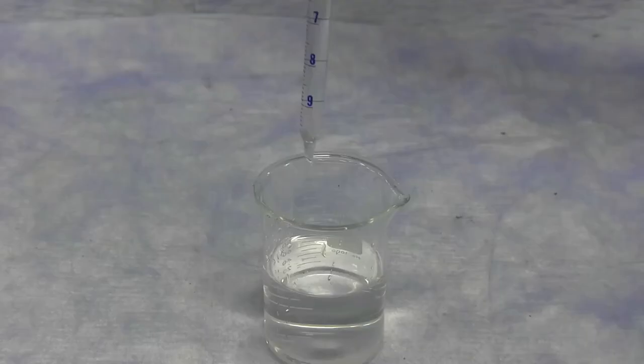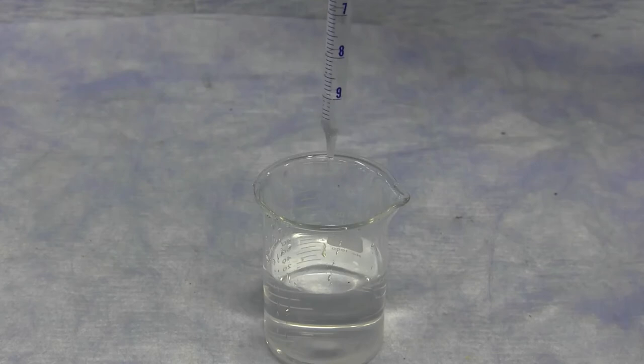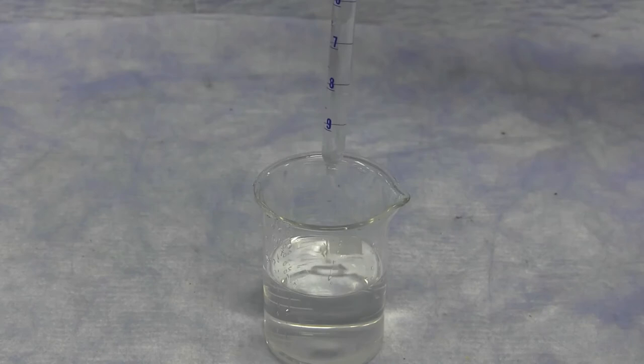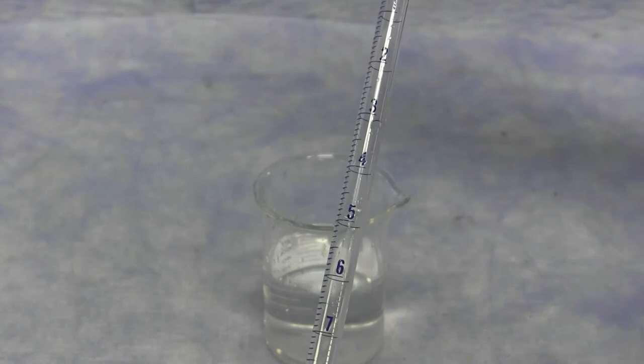As with the pipette bulb, you do not want to dispense the liquid all the way to the very tip. Typically, you would want to dispense to where there are still graduations and markings on the pipette itself. You can always redraw up more liquid into the pipette in order to dispense more in the other container. Just be sure to know what is your initial pipette reading and what is your final pipette reading in order to determine what is the volume that is dispensed from your pipette.